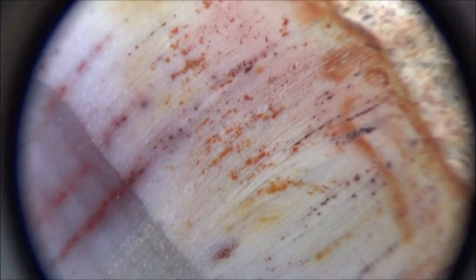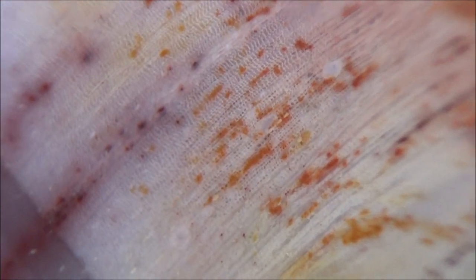This sphere could be pollen of an ancient plant. The polished pieces of petrified wood can be very interesting and often preserve microscopic structures of cell walls.